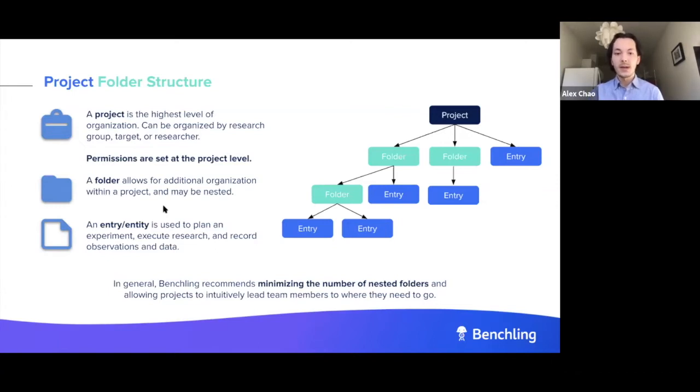And folders are simply a way for you to add additional organization to the notebook. Importantly, they do not set permissions. Again, they're just a way to organize the data within the notebook.